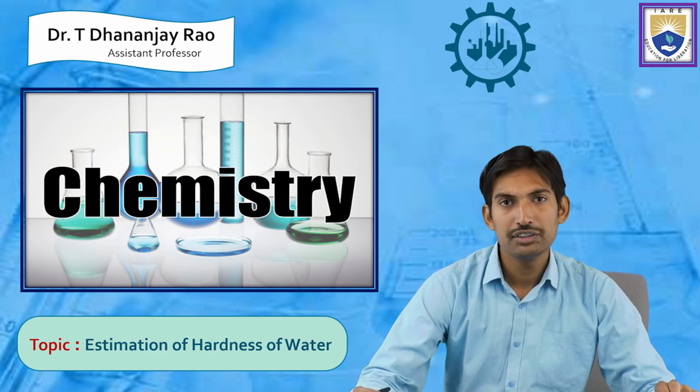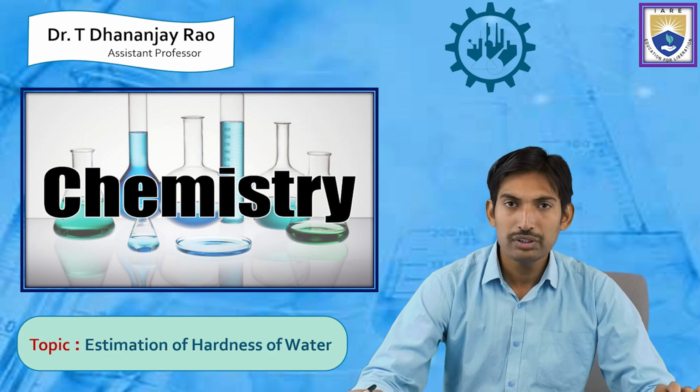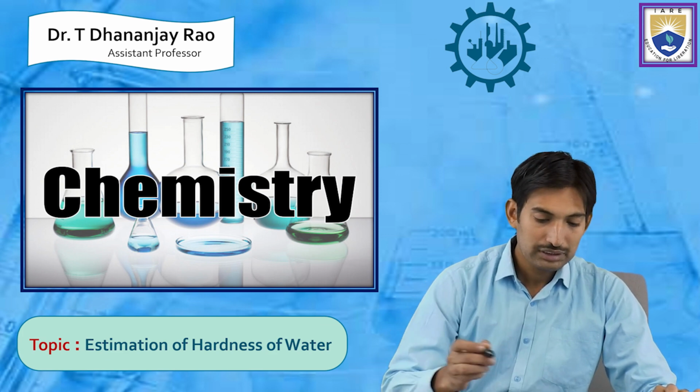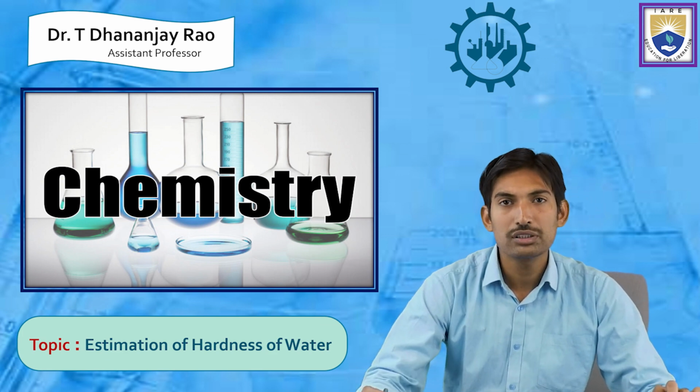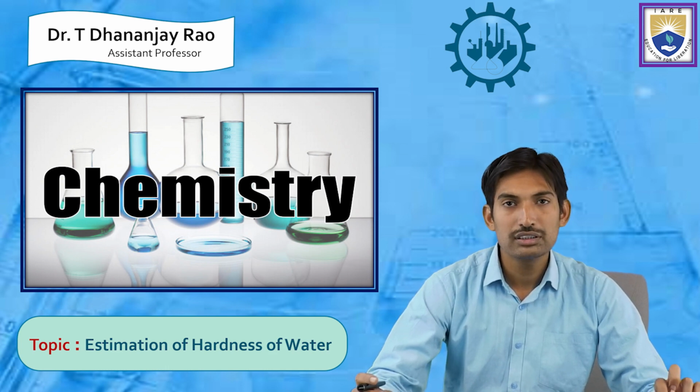In the previous video, I explained the types of hardness of water, temporary hardness and permanent hardness, and the different units for the hardness of water. Today, I am going to explain the estimation of hardness of water by using the complexometric titration method.